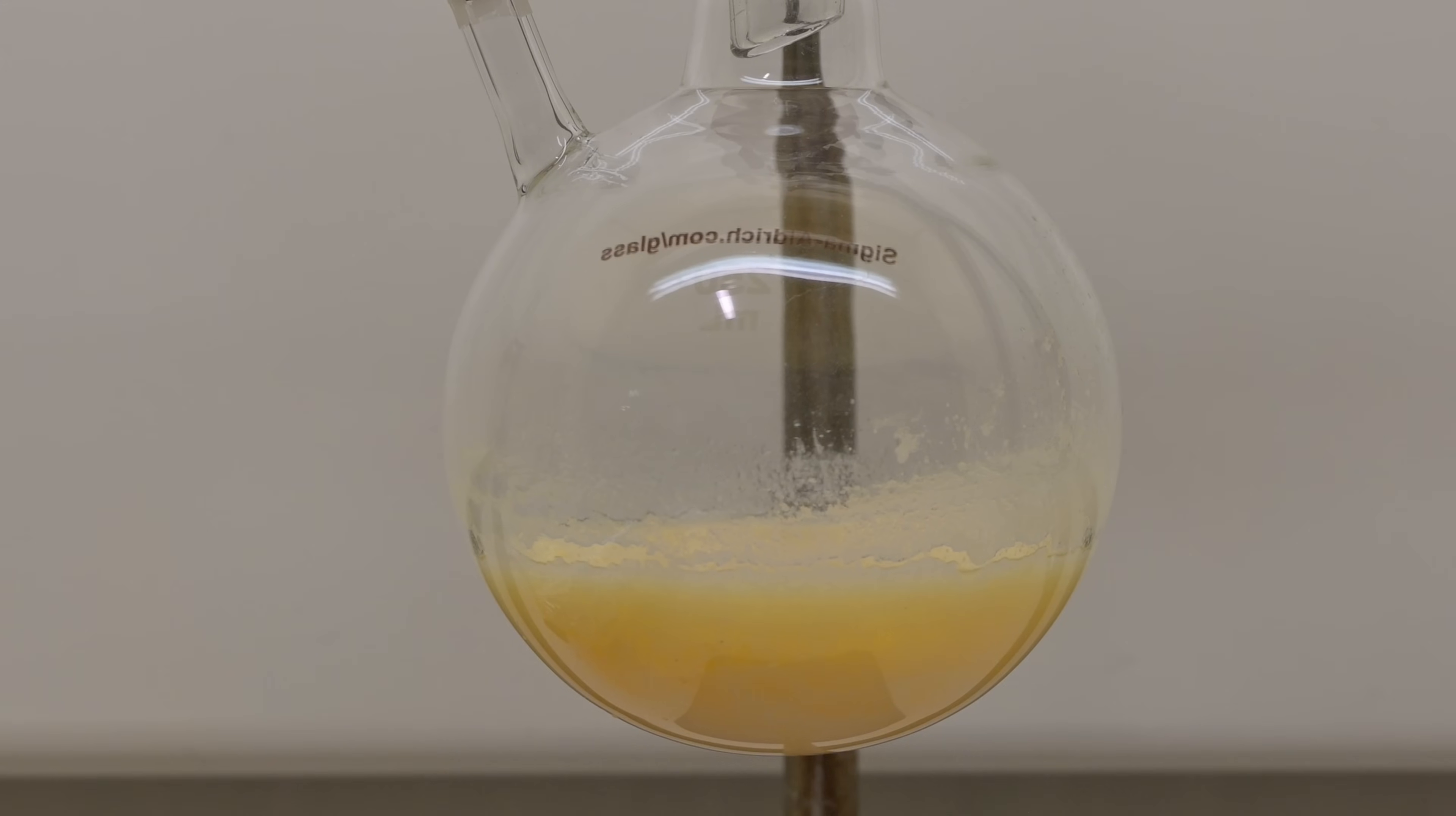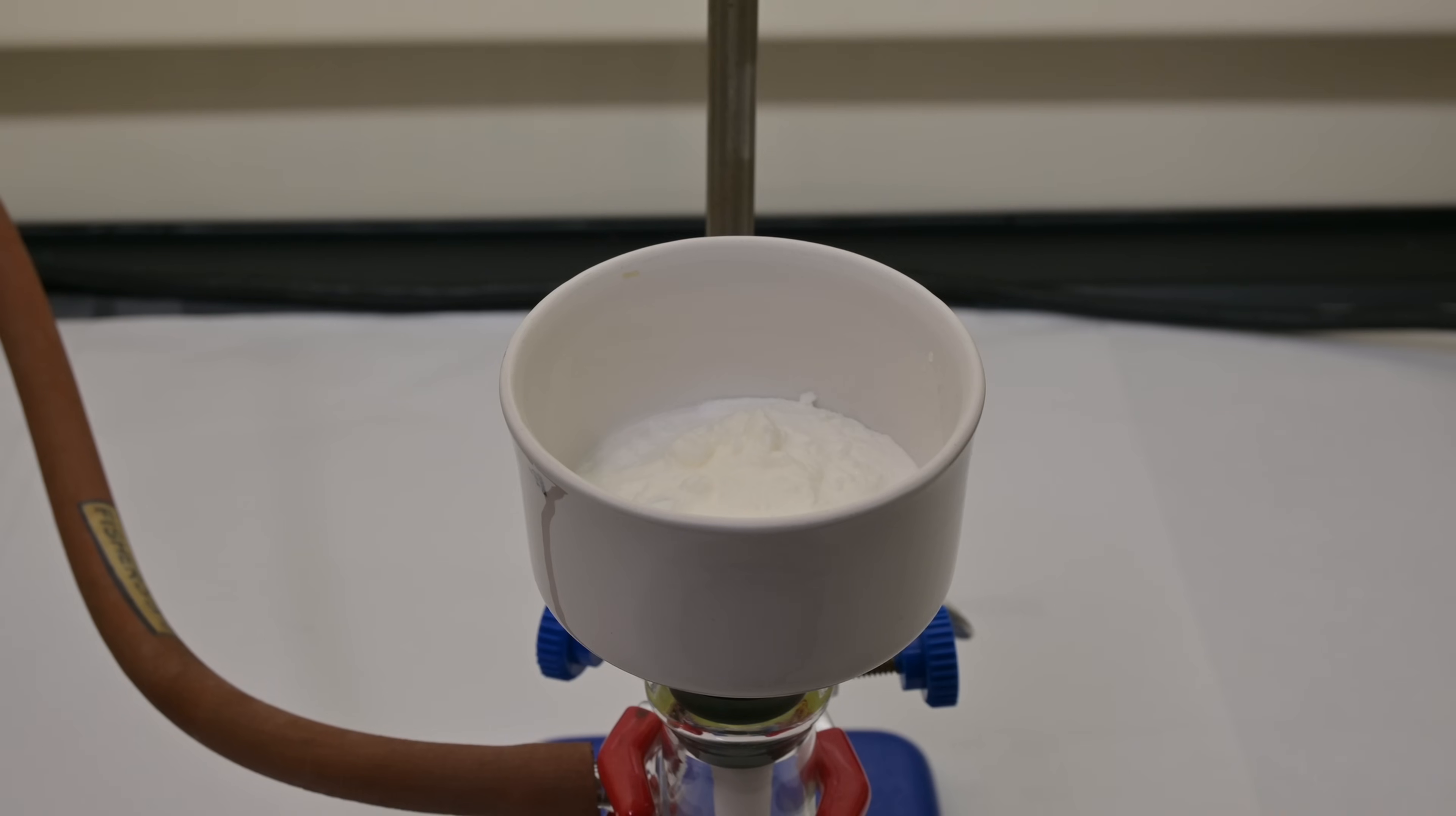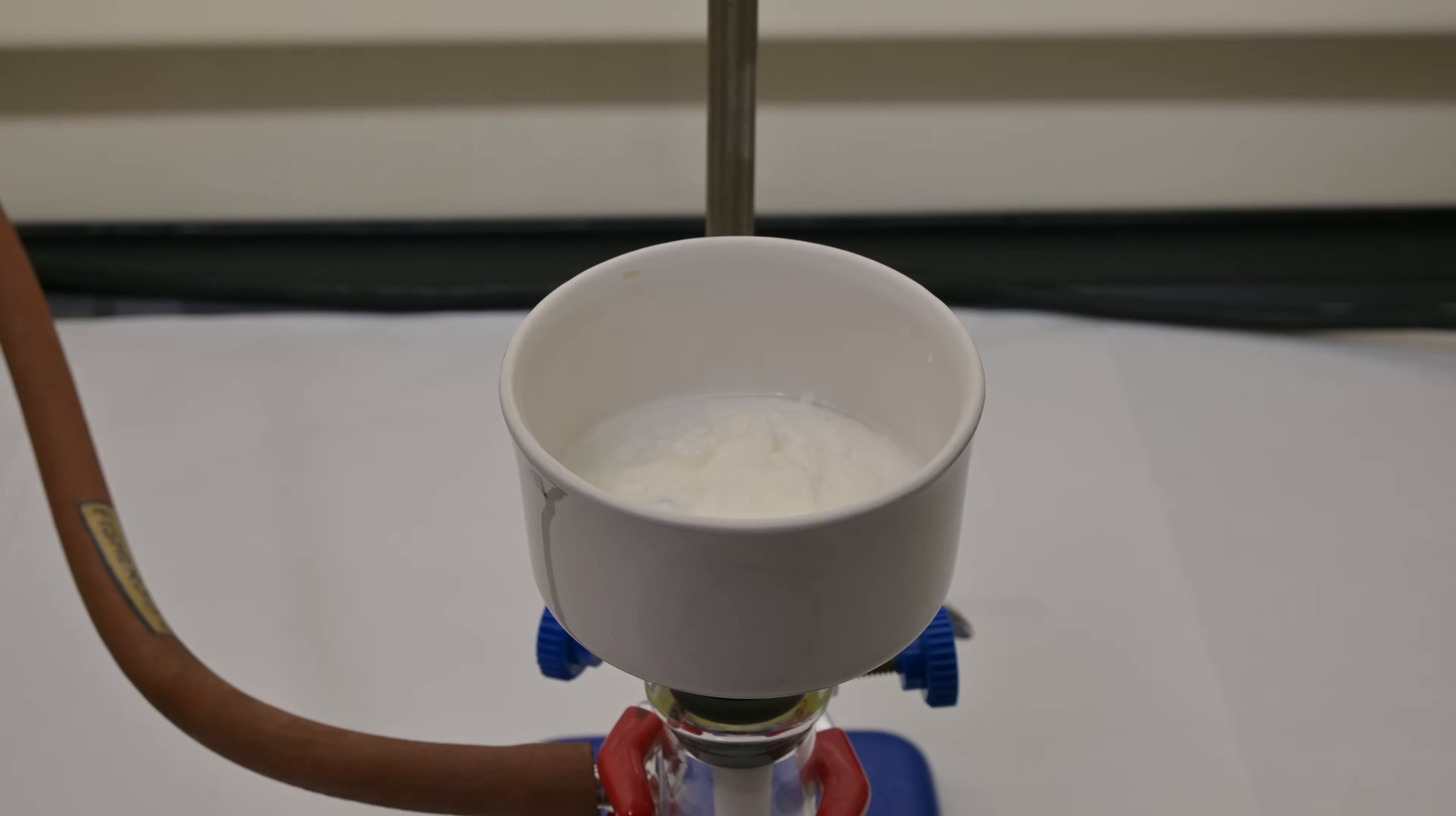Once the product has fully crystallized, we collect it using suction filtration. We wash the crystals thoroughly with two 15ml portions of 50% ethanol solution and several washings of water, to ensure that any impurities such as unreacted benzaldehyde or leftover thiamine are removed. Finally, we let them filter to remove as much moisture as possible, and then spread them out in the air to dry.